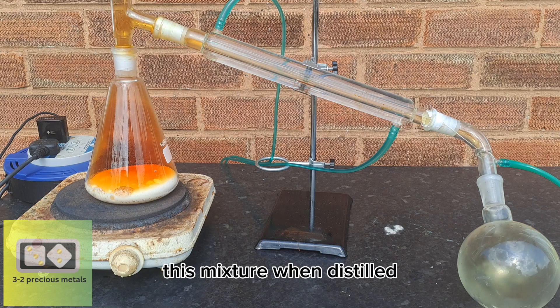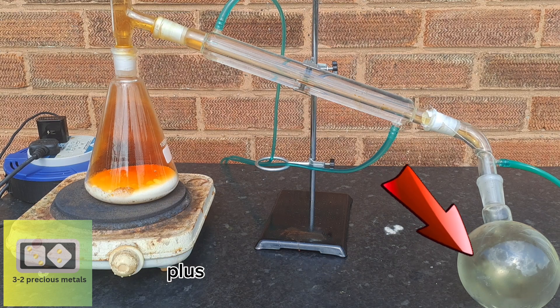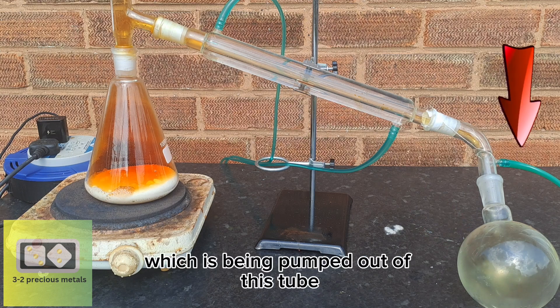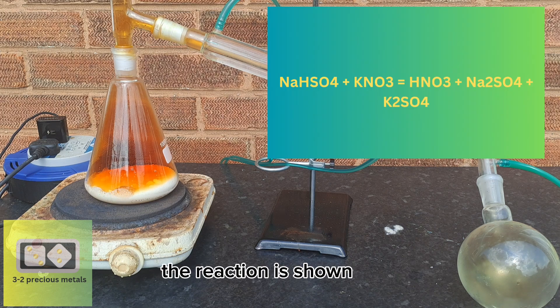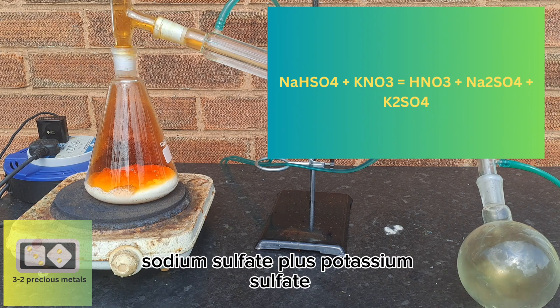This mixture, when distilled, will produce nitric acid into the receiving flask, plus nitrogen dioxide gas, which is being pumped out of a tube into a graduated cylinder filled with 100 ml of distilled water. The reaction is: sodium bisulfate plus potassium nitrate equals nitric acid, sodium sulfate, plus potassium sulfate.